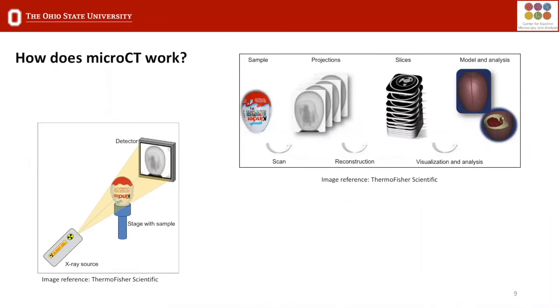During the rest of the talk, we will discuss the first step of the workflow shown in this diagram, the sample preparation.